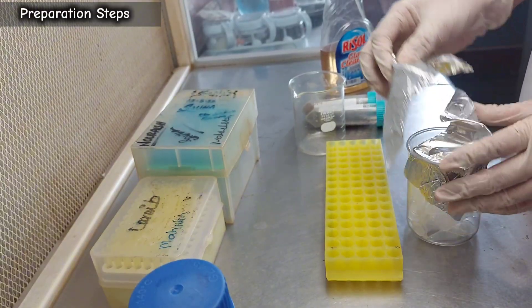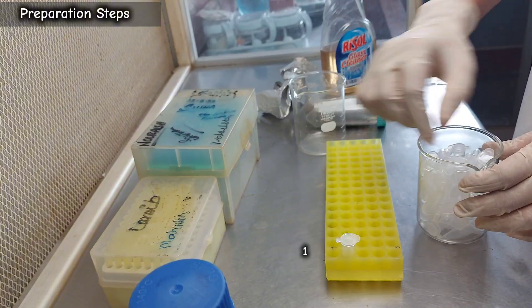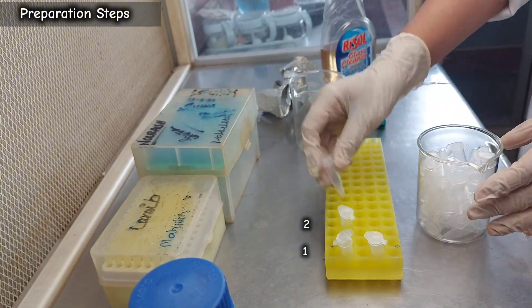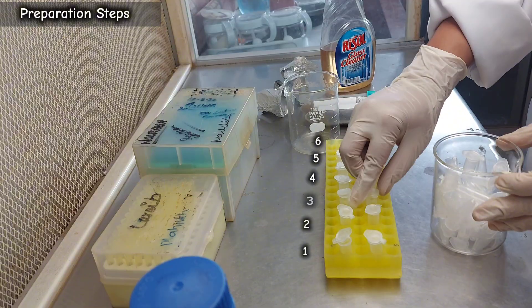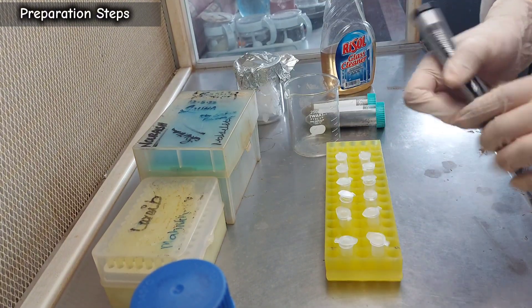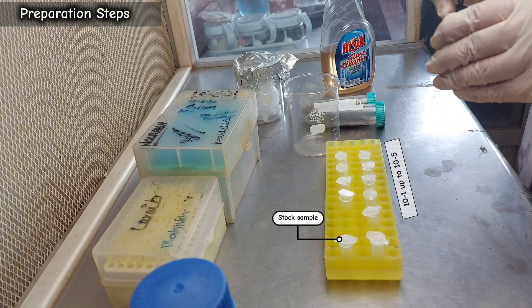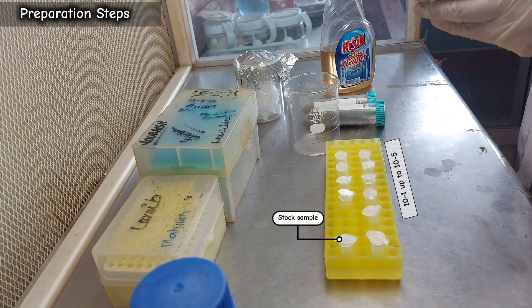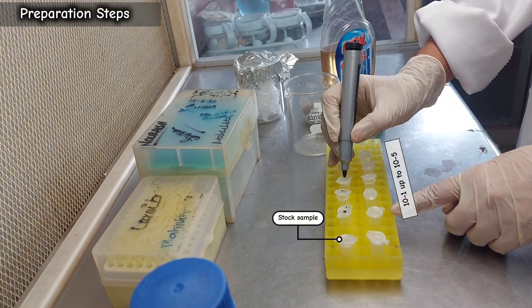Take out your autoclaved Eppendorf tubes and place them on an Eppendorf stand. You will need six tubes per sample. Label the first tube as the stock sample and the subsequent tubes as 10 to the power of negative 1, 10 to the power of negative 2, and so on, up to 10 to the power of negative 5. Here we will work with two samples.